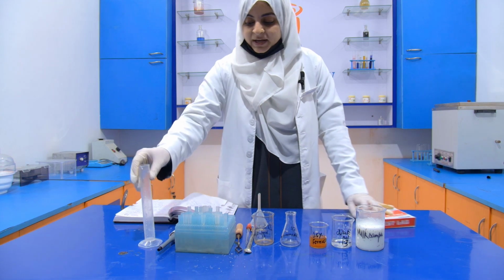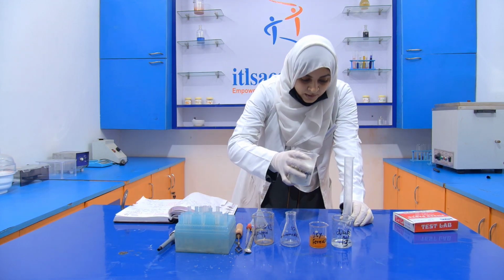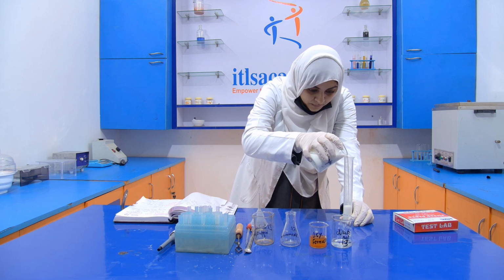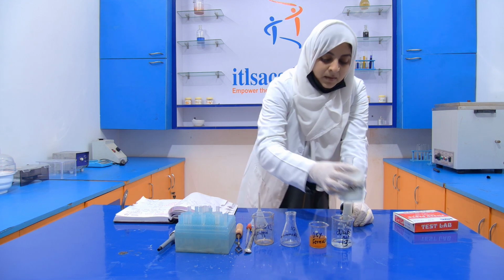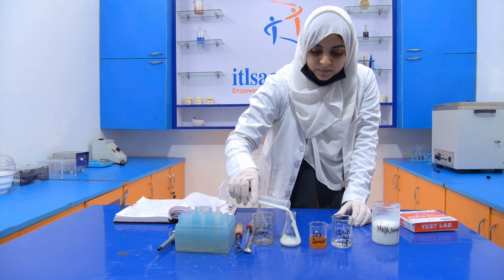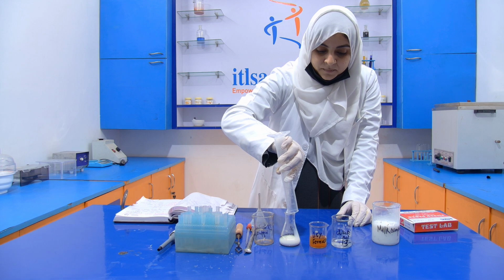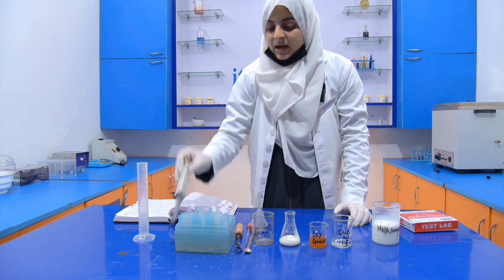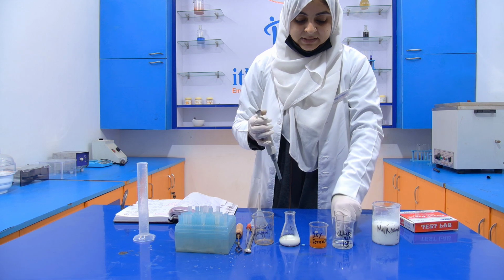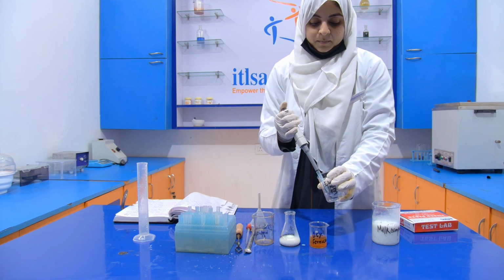Now we have to take a sample with the help of this measuring cylinder. We are going to take 20 ml. Now we have to add 2 ml of dilute HCl into the milk.